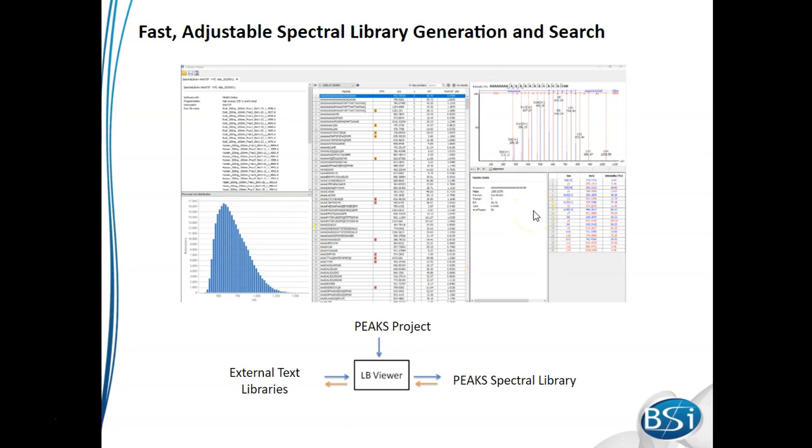From that point, you can then export that library out in a Peaks format, so that it can then be used within the software.